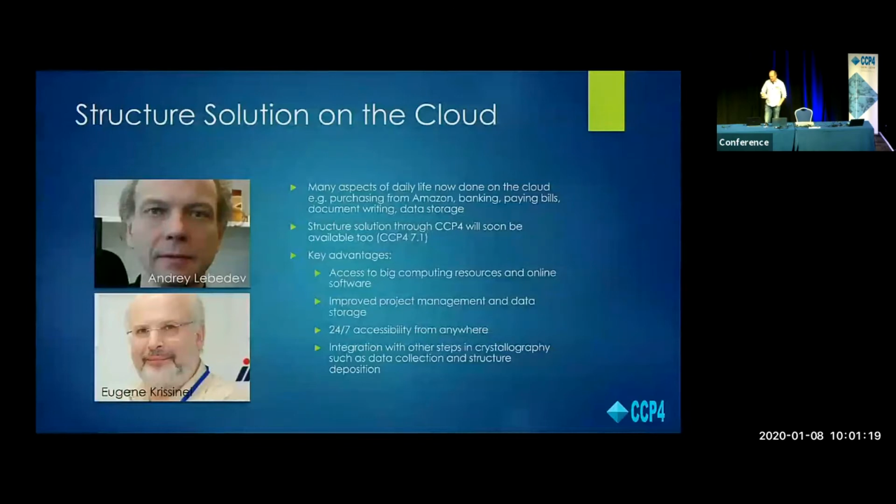So what's that mean? I mean, we do many things online nowadays, such as banking and buying things through Amazon, or paying our bills, or storing documents. So why not do the same with structure solution? And it's due to be released in CCP4 7.1, but you can try it now if you want, and it just requires a little bit of additional software installation, and I'll show you where to get that.